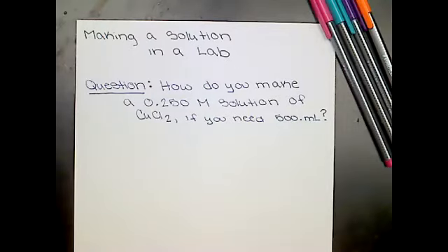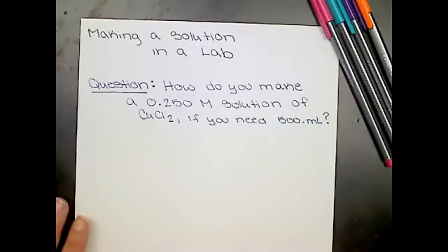Okay, so what we're going to be looking at today is how to actually make solutions. What you looked at earlier this week was this idea of solutions and being able to identify the concentration of a solution. And you learned about molarity, which is a way that we can identify how concentrated a solution is. So now we know what molarity is. Now let's talk a little bit about how we actually make these solutions in a lab.